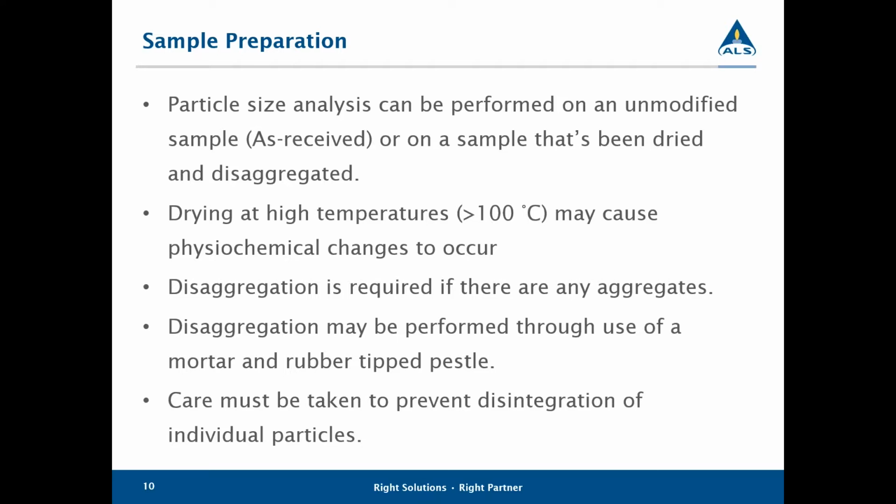So with disaggregation, typically we use a mortar with a rubber-tipped pestle to do the disaggregation, and it's just a very, very soft way of breaking up the samples in order to prevent us from damaging any of those larger particles.